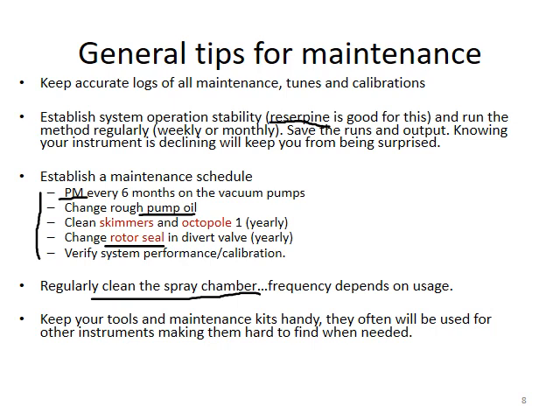Of course, how frequently you clean your spray chamber will depend on your usage. And a good practice is to keep your tools and maintenance kits handy. They often will be used for other instruments, making them hard to find when needed. So you have to make sure you know how to locate your tools and maintenance kits.